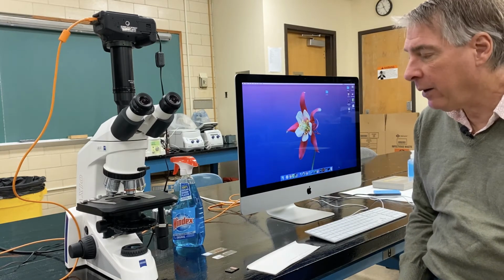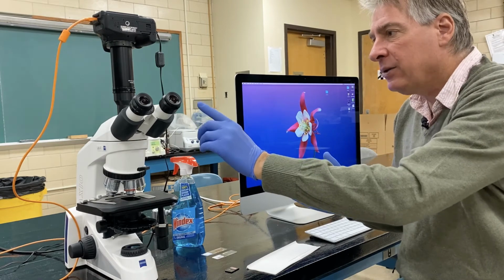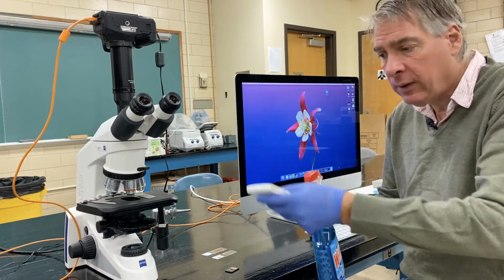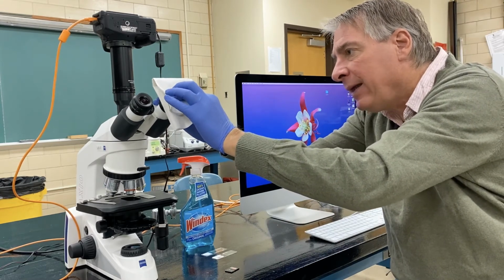To start, I would like everyone to first put on a pair of gloves while they're in the laboratory, and I would like you to clean off the eyepieces with Windex and a paper towel. Please don't spray the Windex on the machine itself, but rather on the paper towel. And then I'd like you to clean both the glass of the eyepiece and then the outside collar.